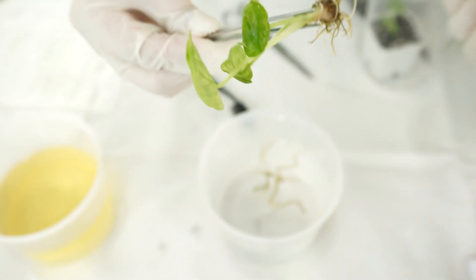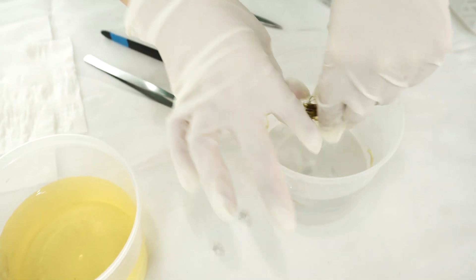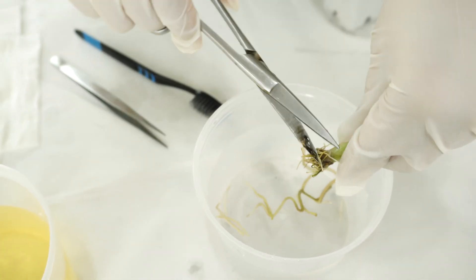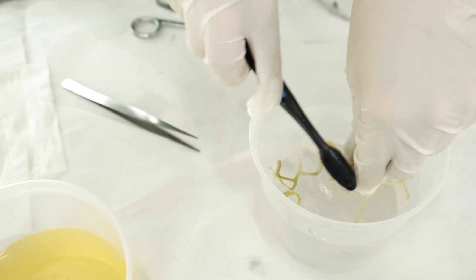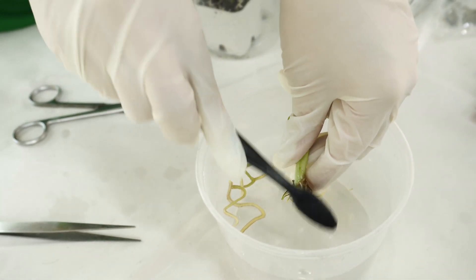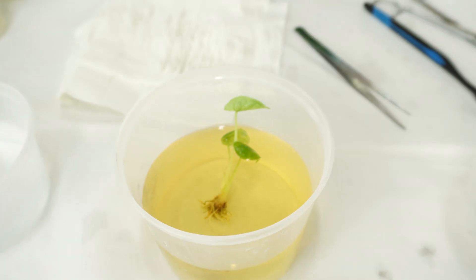We're going to put the Alocasia into the water and do a little bit of trimming and cleaning. We trim just a little bit of the root because this plant doesn't have that many roots, so we try to keep as much root as possible. Use the brush to clean it gently, then soak it in the iodized solution for about one to three minutes.